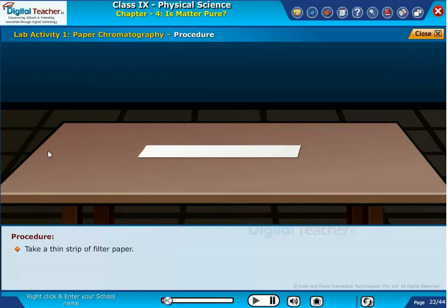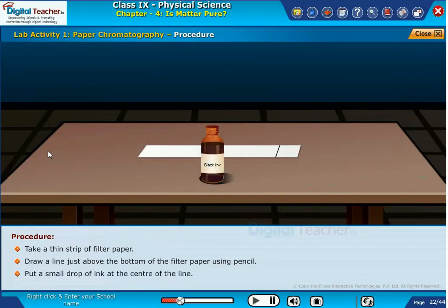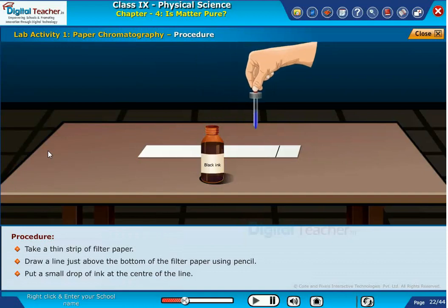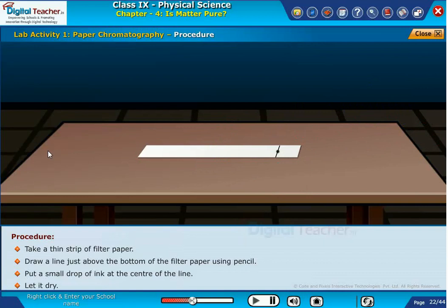Take a thin strip of filter paper. Draw a line just above the bottom of the filter paper using a pencil. Put a small drop of ink at the center of the line. Let it dry.